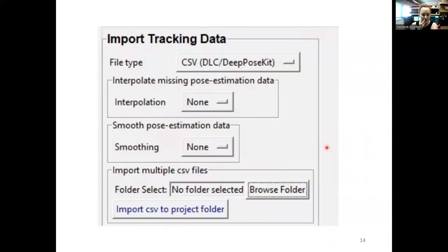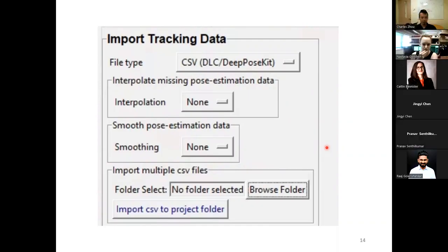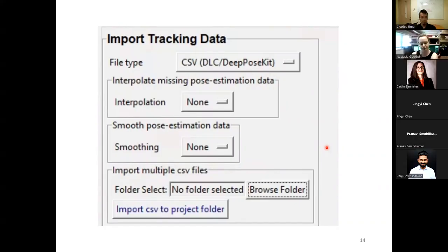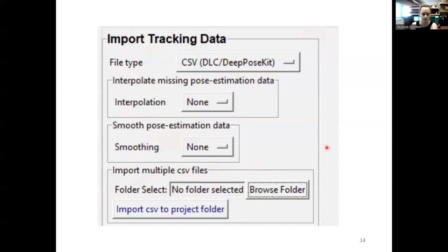And then I'm sorry, what was your other question beyond FPS? Oh, and another thing I noticed when I was doing this is, especially when mice are moving super fast, it was super blurry. And so when I was training the model, I would pick the frame where I can really clearly see the parts that I wanted to label, and that could create a bias, right? Because the training frame is the one that I have confidence in, and I try to avoid picking any fuzzy images, and those are the ones where the mice were actually moving.